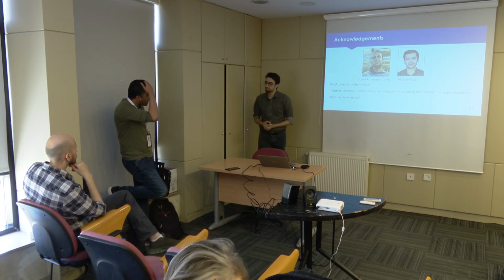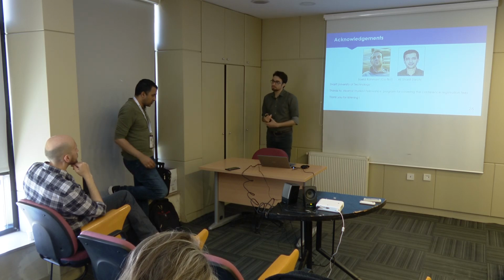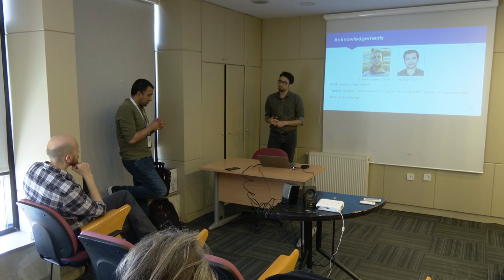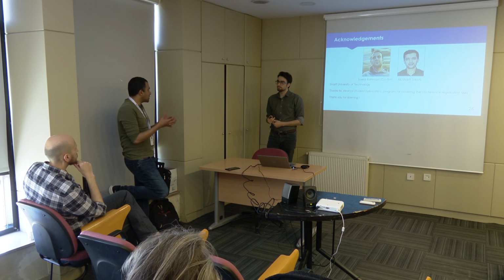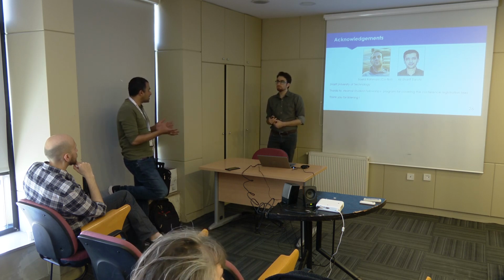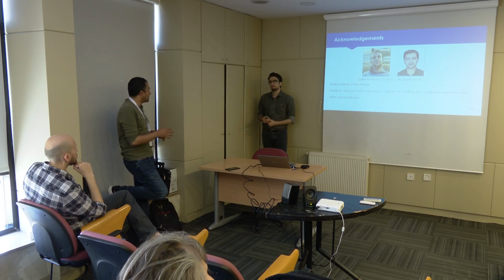So, how does this work relate to all the work on batch correction? Methods like ComBat and RUVseq, which use housekeeping genes or reference genes to correct for batch effects in gene expression RNA-seq data. Do you think these kinds of ideas are relevant there, or is something different in qPCR?